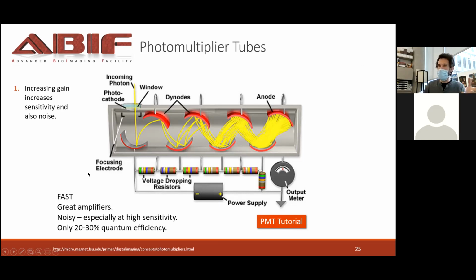So by using these, we can operate at rates that make sense for us. On the microsecond timescale per pixel, so microseconds are super, super short, but then if you're doing a 1000 by 1000 pixel image, which is somewhat standard, that means that'll take, well, 1,000,000 microseconds, so around 1 second. So this is how your acquisitions can easily be on the seconds timescale for a whole image. And it's thanks to this type of technology.